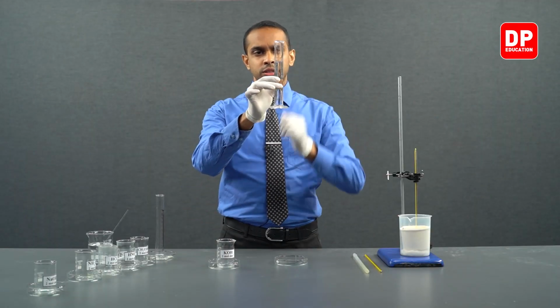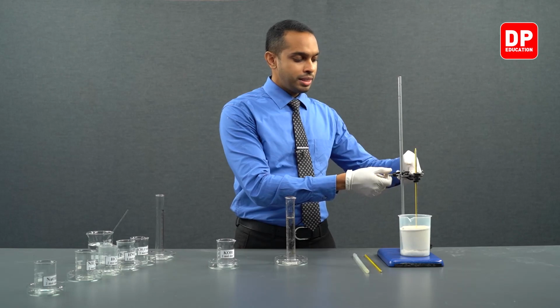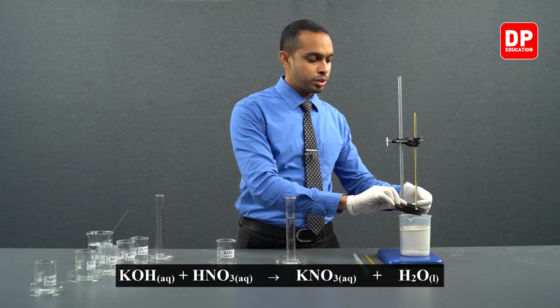We have 50 milliliters of the potassium hydroxide base measured here. Now, we are going to add this 50 milliliters of potassium hydroxide to our nitric acid solution we have here.